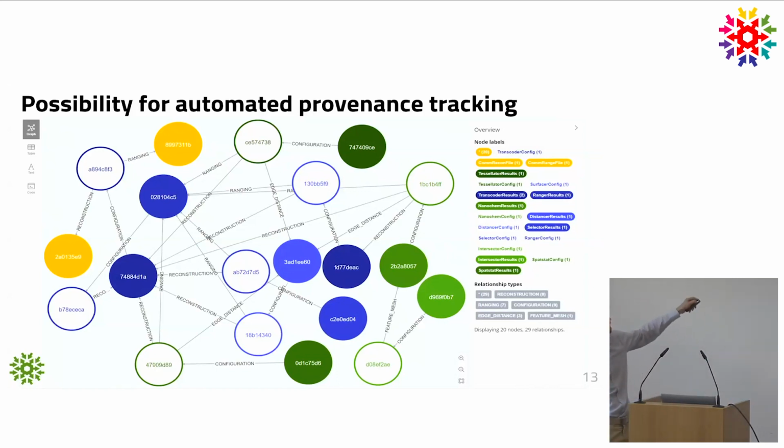On the right side, there are all the different tools that we're using in this software, where you take the data from the vendor representation, you compute the interface, you compute the distance of each atom to the interface, you maybe do a tessellation on the data set. All of these tools write version instances, and because it's a workflow, they interconnect and reuse pieces of information and results coming from previous processing steps. Typically I would have had to do this graph manually beforehand, but now I have my directory where I have all these files in the NeXus representation, and a Python script runs over that and creates a graph automatically for me.